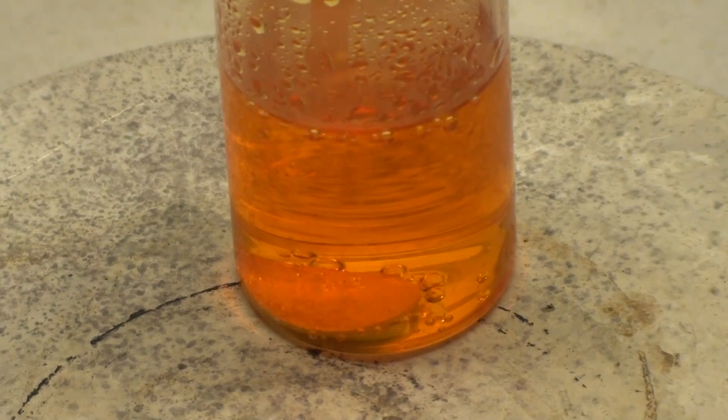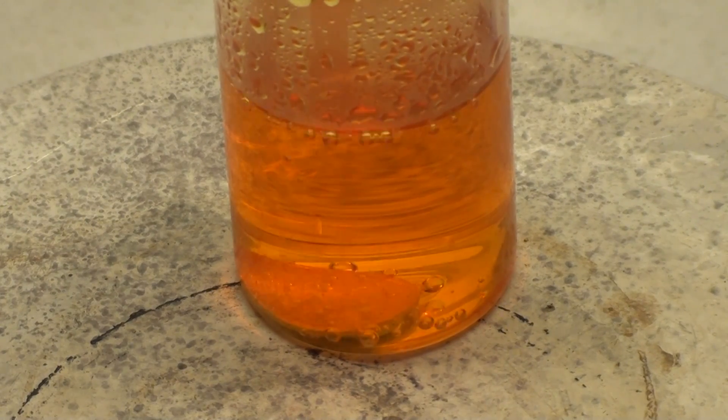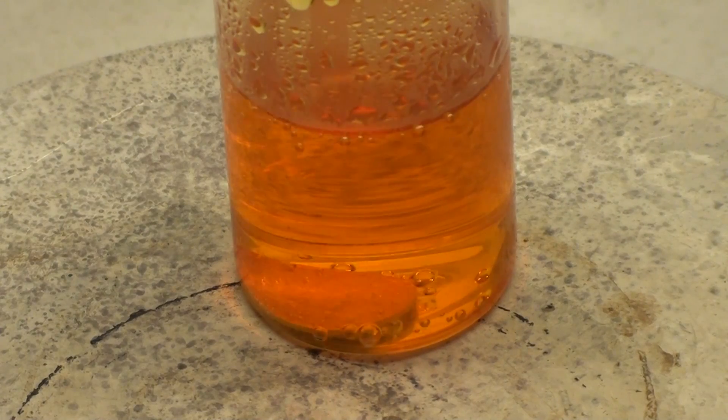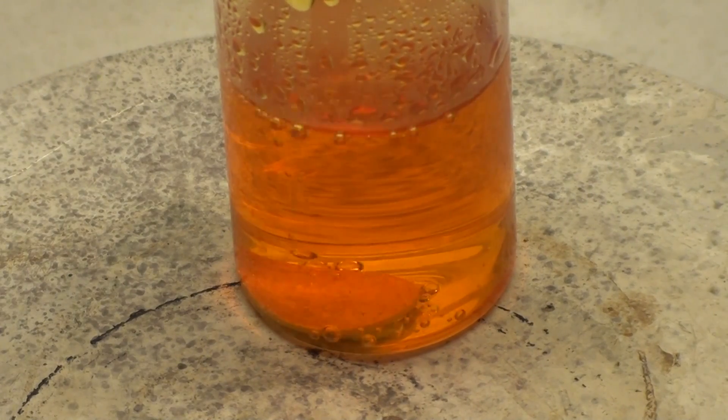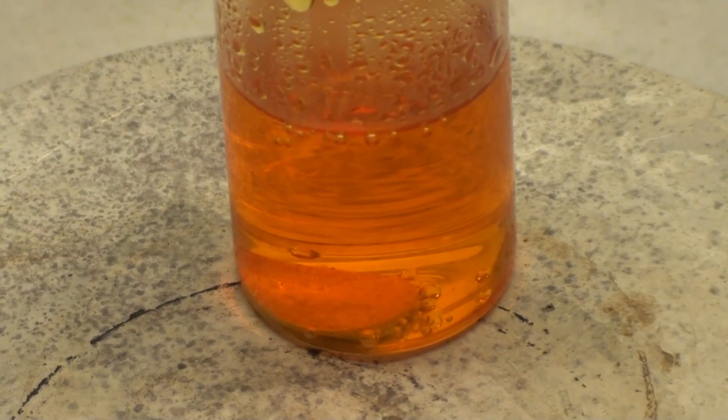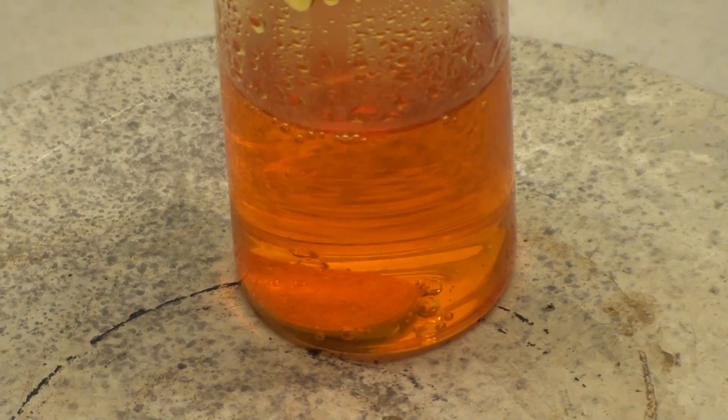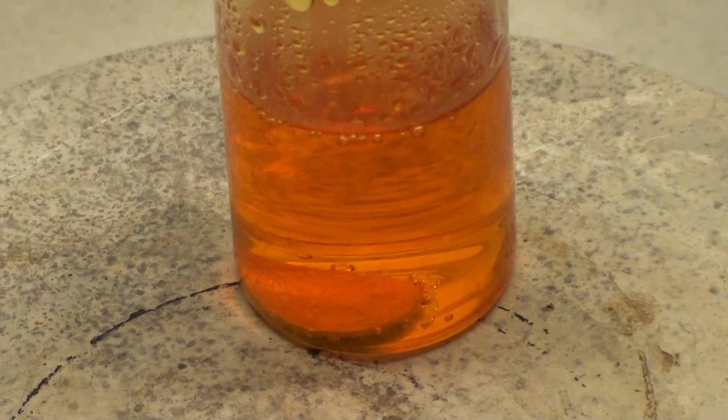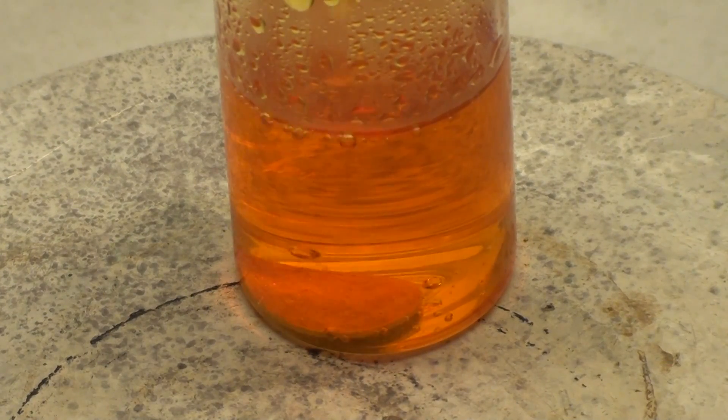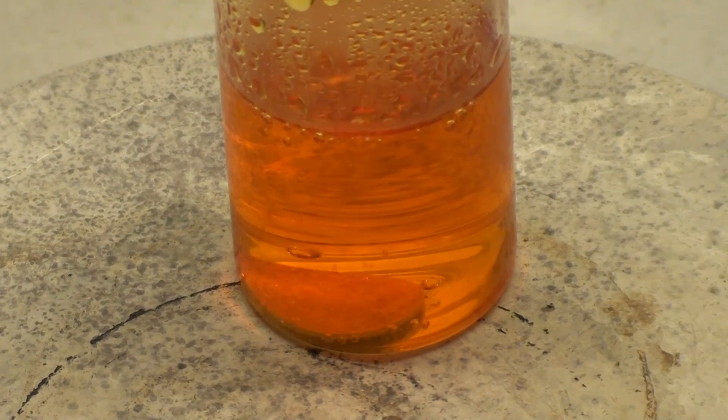Other oxidants also work but nitric acid is the easiest to work with. The bubbles you're seeing are nitrogen dioxide gas along with some nitrosyl chloride, chlorine and nitrogen monoxide. This mixture of hydrochloric and nitric acid is also known by the name of aqua regia.